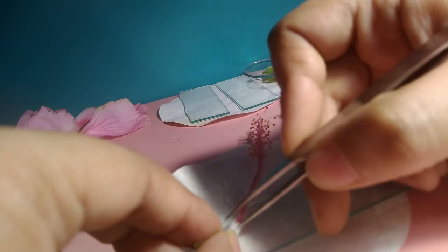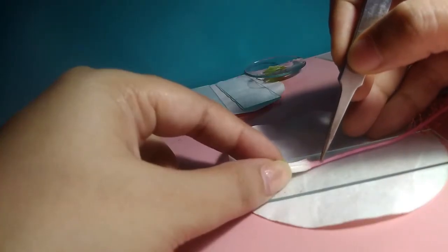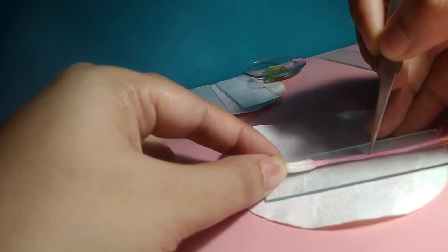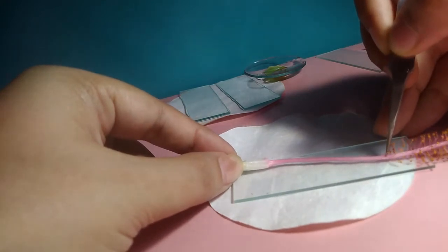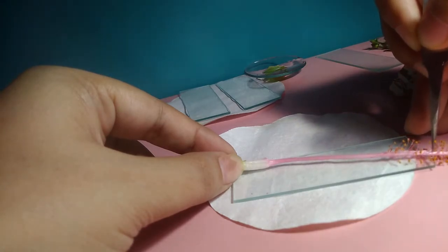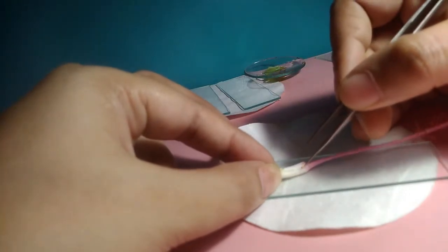I am doing this with a forceps. We will split open the entire tube, but please be very gentle while doing this. Okay. Very, very gently. You can use the finest needle that you have.